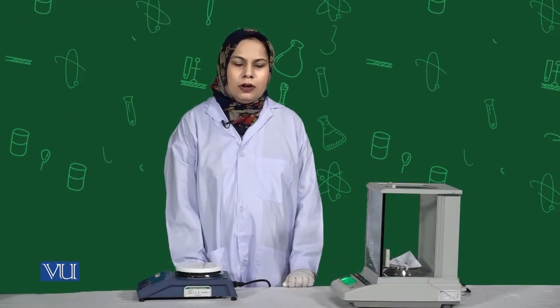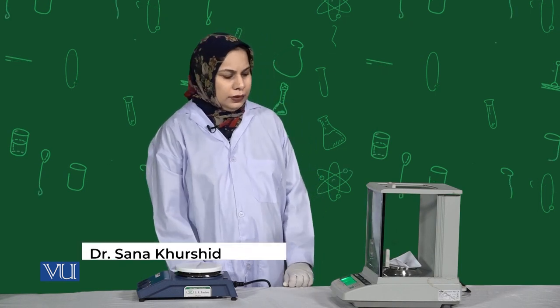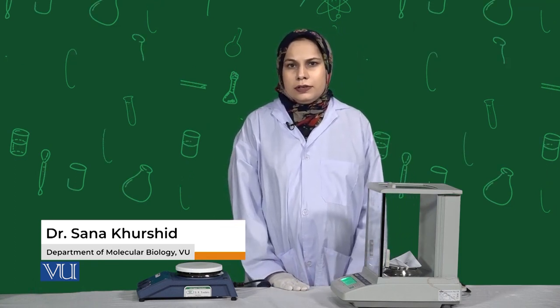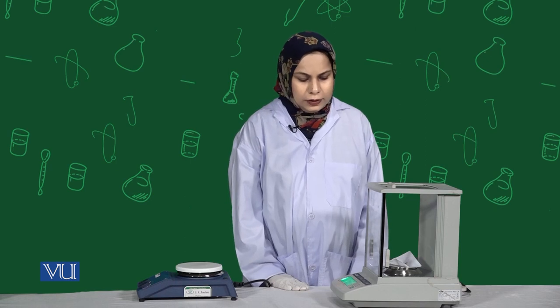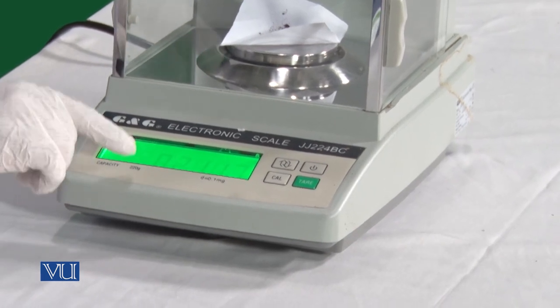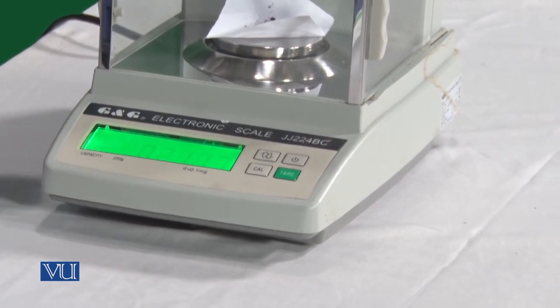Students, now we are going to prepare 10 mg per ml ethidium bromide solution. Ethidium bromide is a chemical used to stain DNA while running a gel electrophoresis procedure. For this, we need 0.2 grams of ethidium bromide powder. This powder is carcinogenic because it can bind to DNA, so you have to be very careful while handling this powder. I have already measured 0.2 grams of ethidium bromide powder.